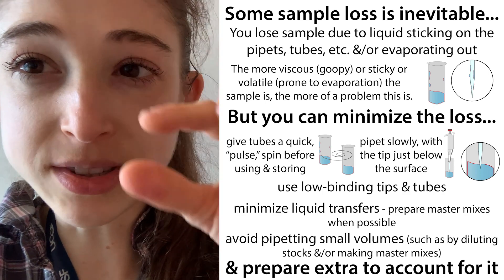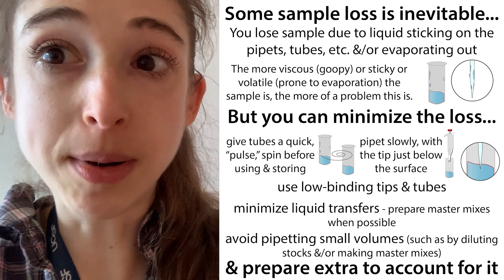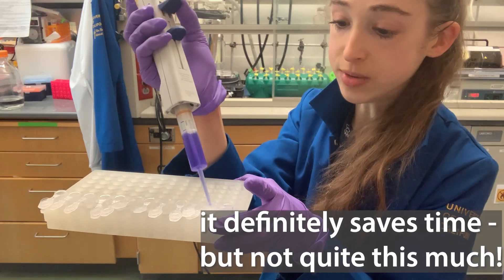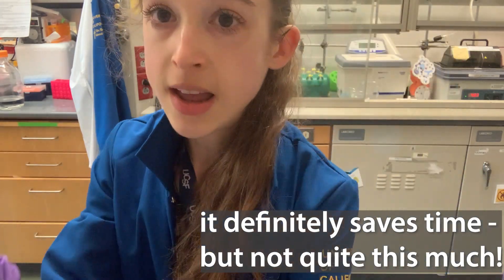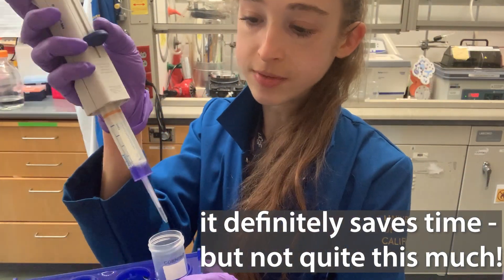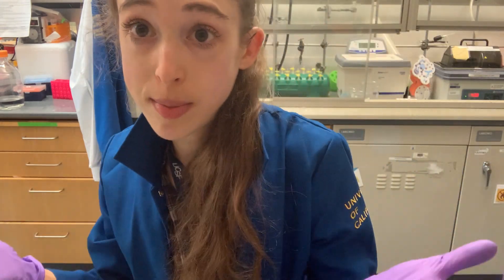Because you can't really use the first and last dispense from a repeater pipette, you can use a separate regular pipette to recover any remaining liquid at the end. And that's how you use a repeater pipette.